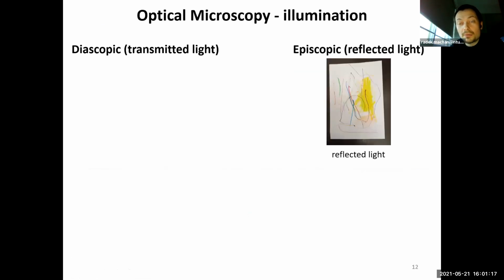So we talked now about the bright field, the transmitted light. Let's go back to the reflected light. So this is another example of a reflected light image. Again, it's not a microscopic image, although this is something which is more biomedical, because this is, according to my daughter, an anatomy chart. So there should be liver, stomach, brain, all is there. Don't ask me what is what.